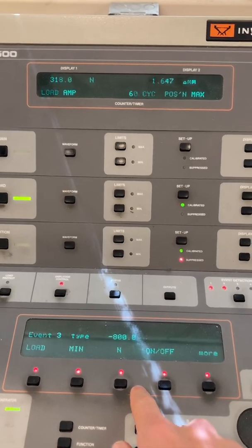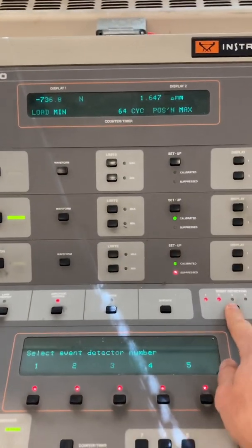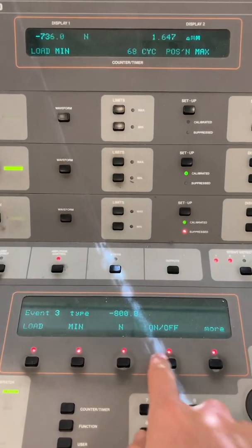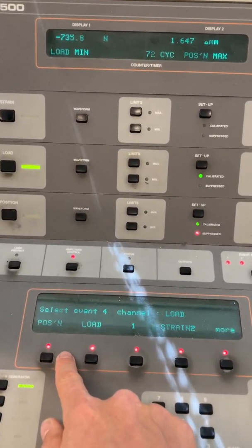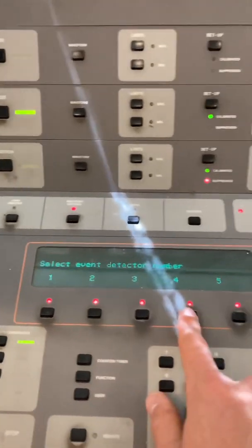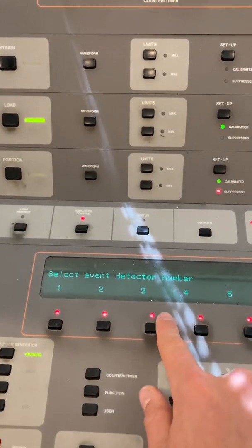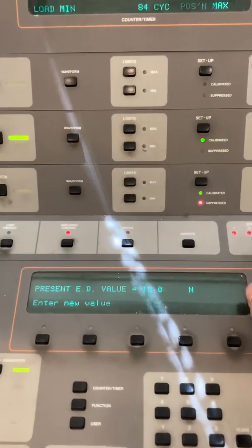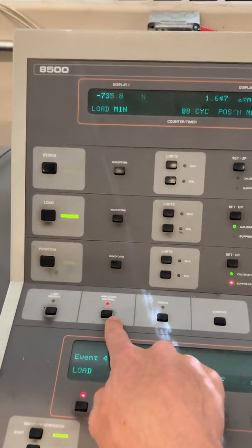If the actuator starts going crazy it'll turn off. Event Detector Three: this is a load one. The minimum load would be negative 736, so we'll set it to negative 800 — it should never go past that because we're in load control, but we'll turn it on just in case. You can add more detectors if you want — I usually just do position and load. You can change the type between minimum or maximum, and change the value as needed.